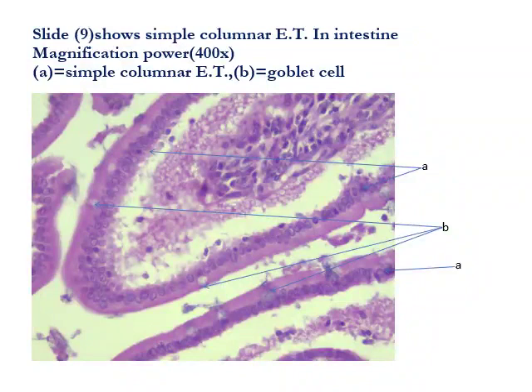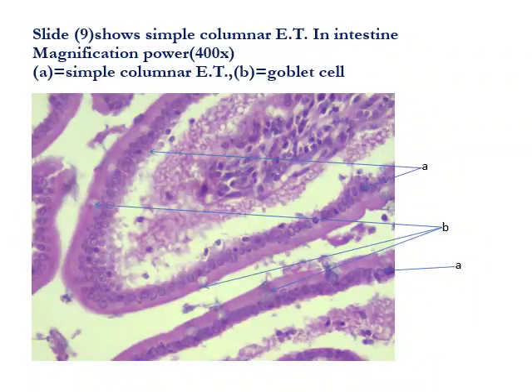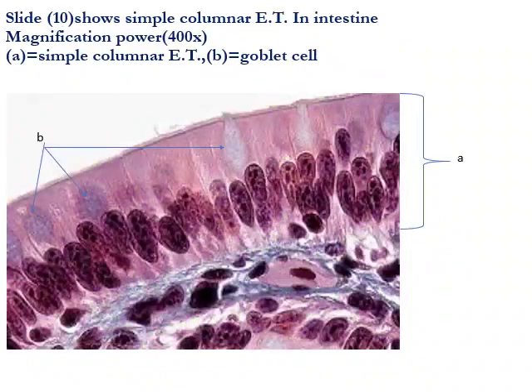At higher magnification, we can observe that the nuclei are at the same level and are elongated, situated near the base of the cell. We can also observe the goblet cells, which appear as swollen cells with a lighter color due to the presence of mucus. These goblet cells are considered a type of gland, which will be discussed further in the glands lecture.